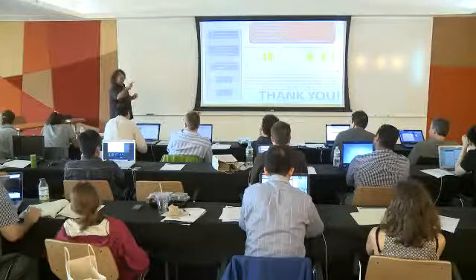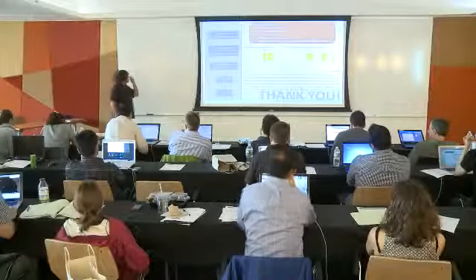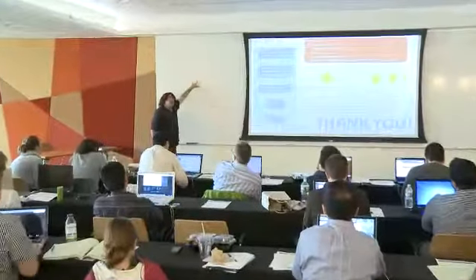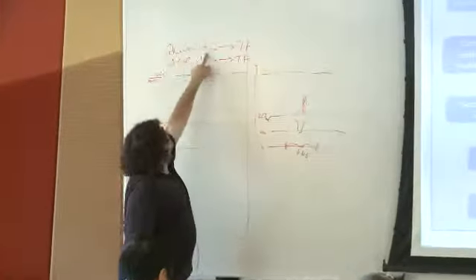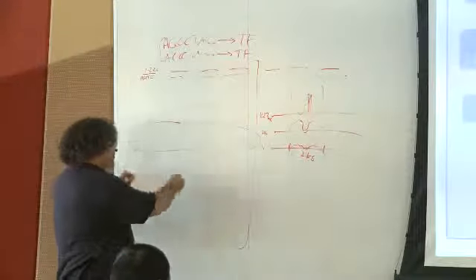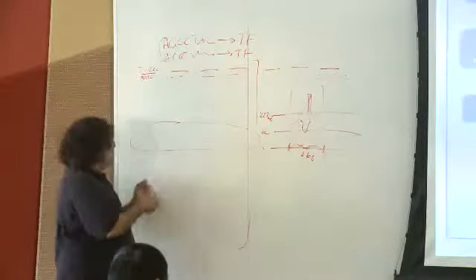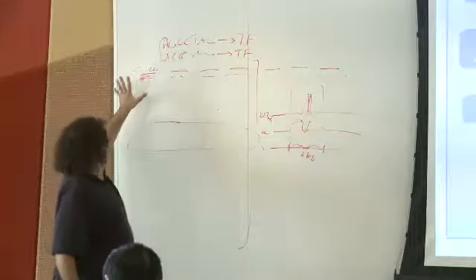First of all, maybe more than one. Maybe several motifs are relevant for a given enhancer. But really, you don't just look at one of them all by itself. You look at a combination of maybe 1,000 such enhancers. And then you find this sequence to emerge as significantly enriched. So now, even though there are several motifs in general, several things that in other situations have some meaning, under your enhancer, probably only one of these is found. One of those that are enriched in this set.